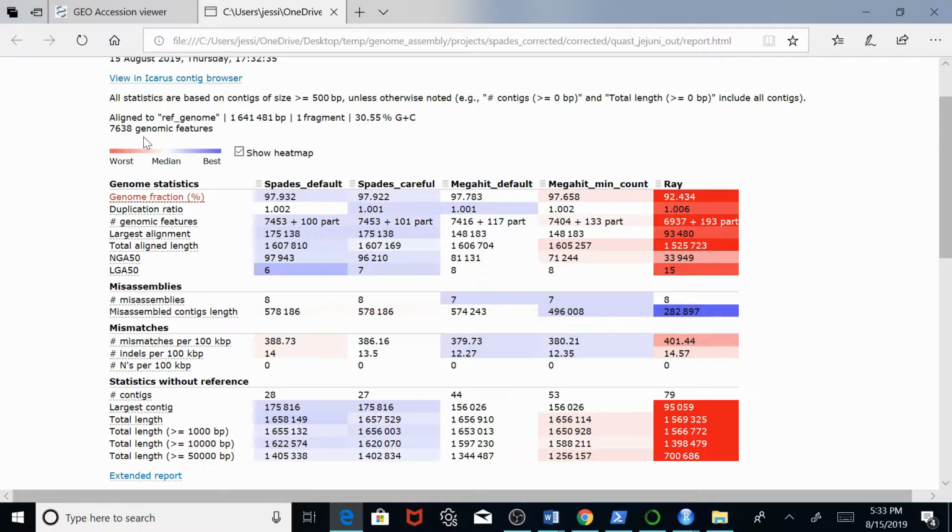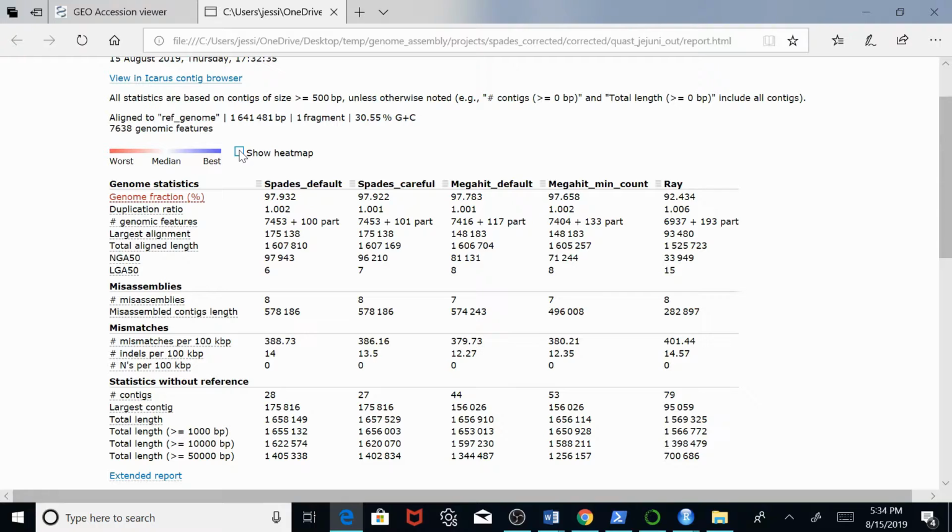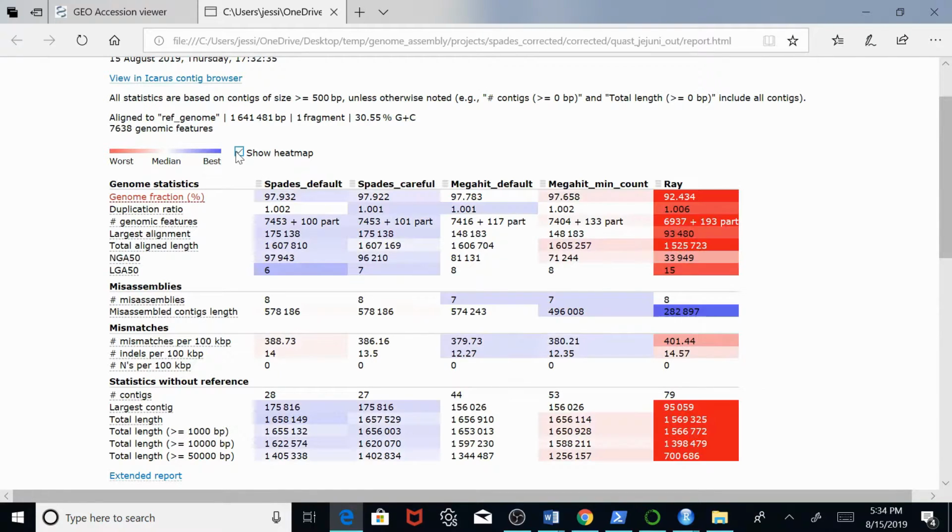This coloring is just to help your eye differentiate between the differences. The differences might be minimal, they might not even be that significant, but it just gives you an idea. It's always up to your interpretation of the results, because the differences might not be that significant between each other. This is just to give you a visual aid to see what's going on. You can obviously take it off, but it helps you to compare between them more easily.